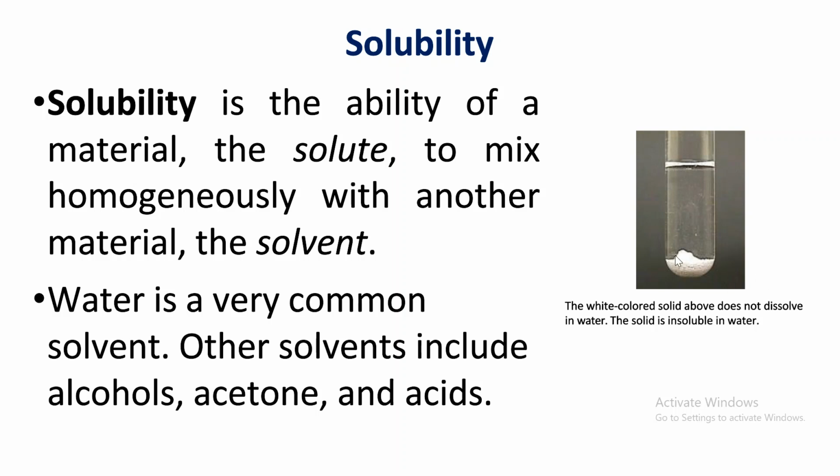So if I were to ask you, is this solute, this mystery solid, dissolving in water? The answer is no, it's not dissolving because it's settling to the bottom of the test tube. Since it's not dissolving, we say this salt has low solubility in water, or we can say it's insoluble.